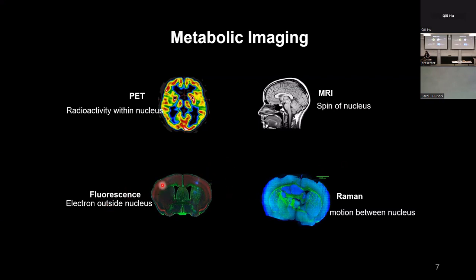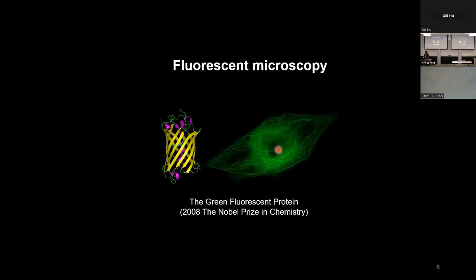And optical imaging technology such as fluorescence or Raman can be a great tool to resolve that kind of spatial resolution. And I'm going to introduce the Raman-based technology. In the past, it was label-free, but now we introduced bioorthogonal chemical bond imaging to visualize even newly synthesized molecules, such as new protein, lipids, DNA, RNA, or carbohydrates, and distinguish that signal from the pre-existing older molecules. Then you can visualize the real metabolic dynamics at the cellular level.